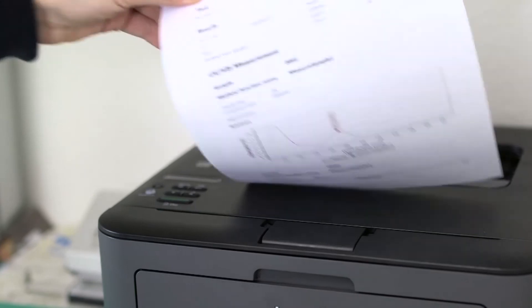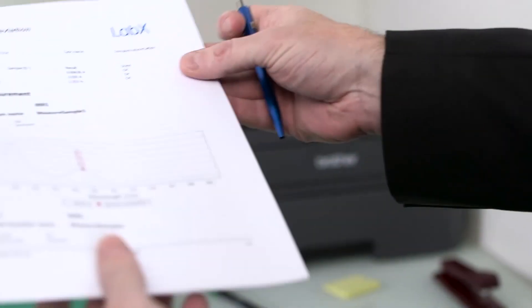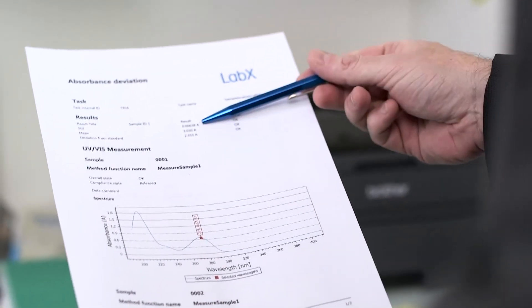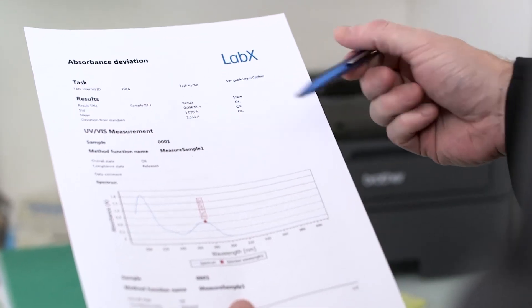Supplying the necessary documentation of a fully controlled and accurate process is immediately available. Data integrity through the whole process is simplified and achieved with LabX.